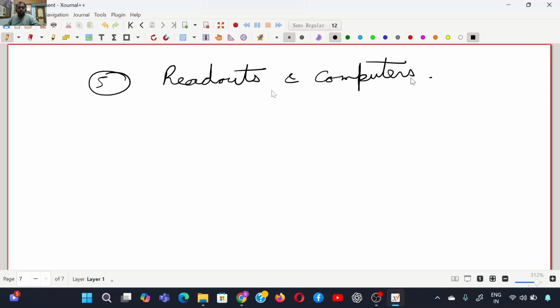The computers basically store the calibration curves, compare results, perform error analysis, etc. There are automatic samplers in the instrument, and the computer functions basically range from adjusting the gas flow rate for a stable flame, controlling the flame lighting and ignition, and moving the burner head automatically when changing gases. They also store element specific data and run background corrections, interference corrections, standard additions, etc.